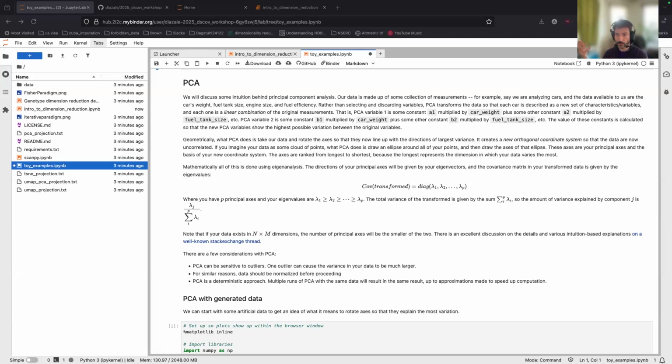For those of you who work with transcriptomic data and packages like ScanPy or Seurat, or whatever is popular these days, keep in mind that if you increase or decrease the number of principal components, you're going to find a different representation of your data. Just to hammer this home, you're always working with different representations of the same data. So I encourage you to play around with the number of principal components, because you could find some signal even in very well explored data sets that people have just not bothered to look at.